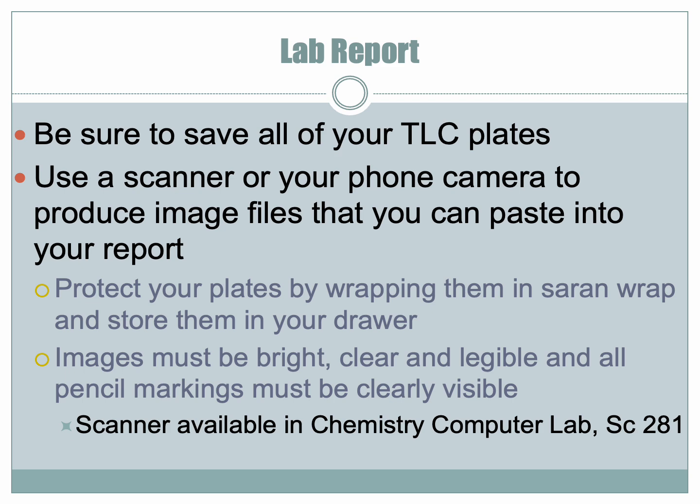For the lab report, make sure you save all your TLC plates. You can use a scanner or your phone camera to make images for your lab report. Protect your plates by wrapping them in saran wrap and store them in your drawer. Images must be bright, clear, and legible, and all pencil markings must be clearly visible. There's a scanner available in the chemistry computer lab, or it's probably just easiest to use your phone camera.